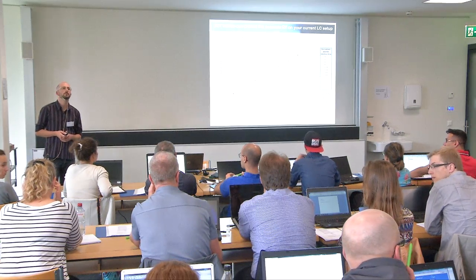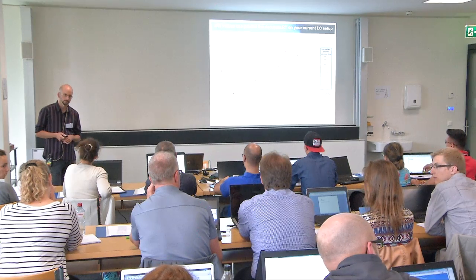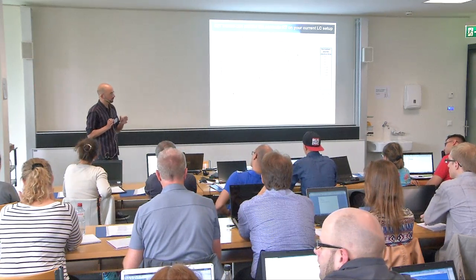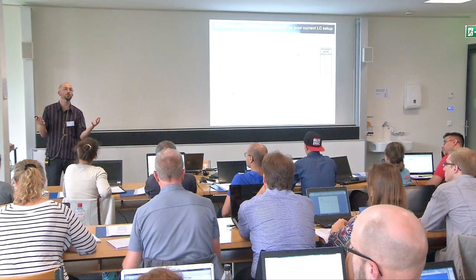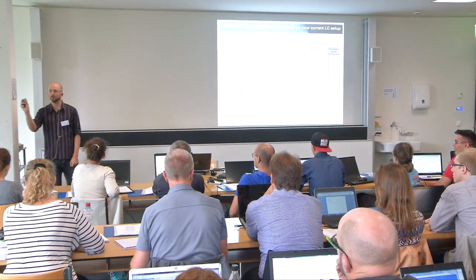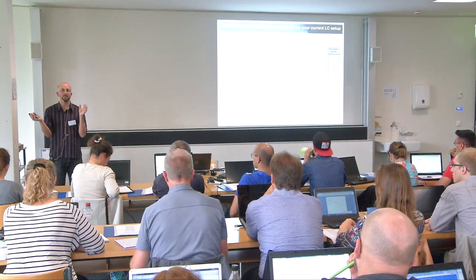That means if you want to do a similar kind of study and compare your result with the results from other data, you have to use the same set of standards. Yes. So if you want to compare two data sets and they came from different labs and they also used different chromatographies, you cannot look just at the table and say, well, if this peptide eluted at 50 minutes and for the other lab it eluted at 30 minutes, you wouldn't know if this is the same peptide, just different chromatographies, or this is the wrong peak identified on two setups.